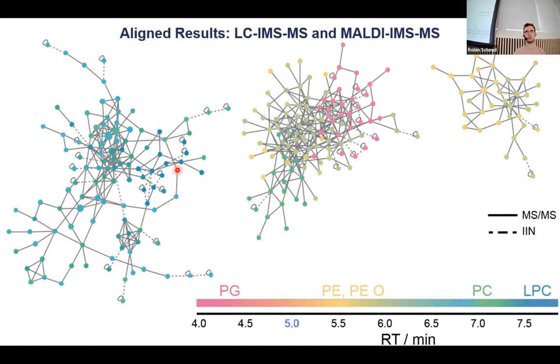You can say, okay, this phosphatidylcholine in positive mode has to produce the phosphatidylcholine head group fragment, or in negative mode, we also need to see the fatty acid chain fragments. And if the fragments have these mass-to-charge ratios, then it must be this fatty acid. So that's basically a computational spectral library.